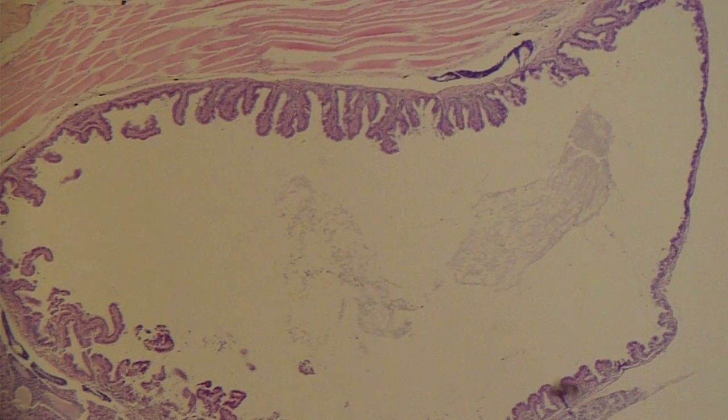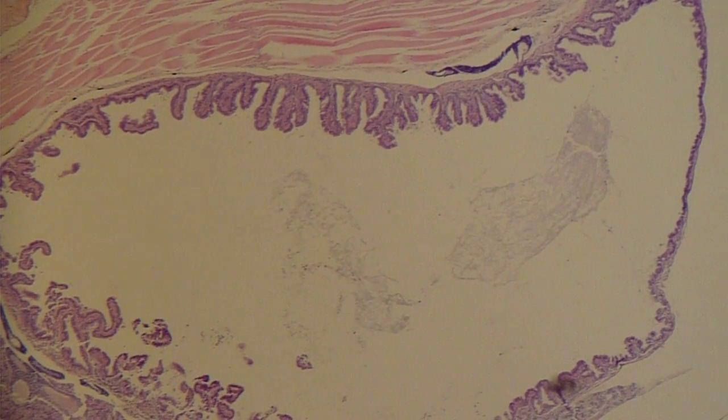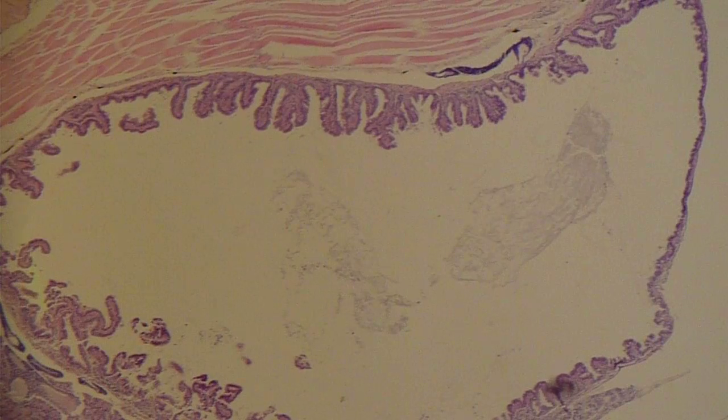Today we're reviewing the gastric and also the hepatic and pancreatic sections of a marine ornamental fish. In here you can see a distended part of the gastrointestinal tract — I would call this the stomach — and you can see it's very empty, indicating that it's not had a meal recently, probably within when it was euthanized.